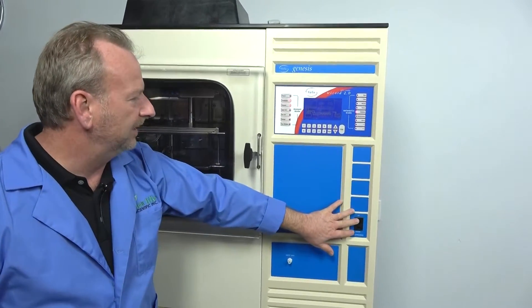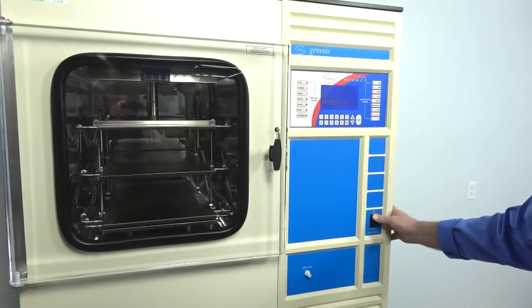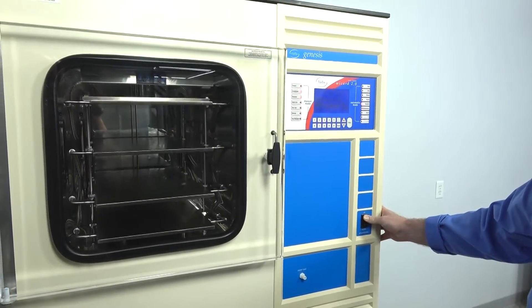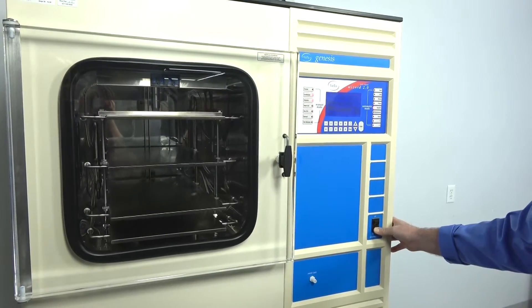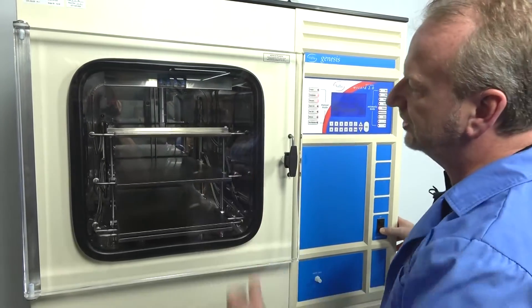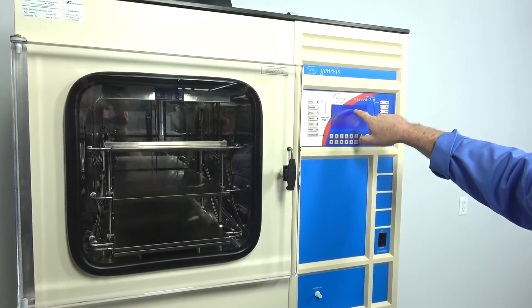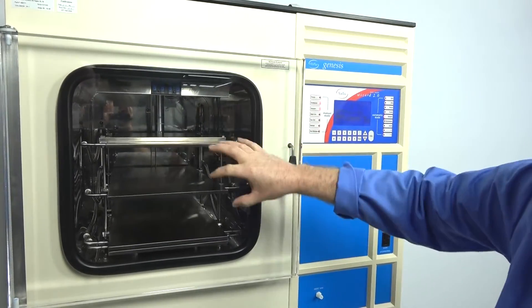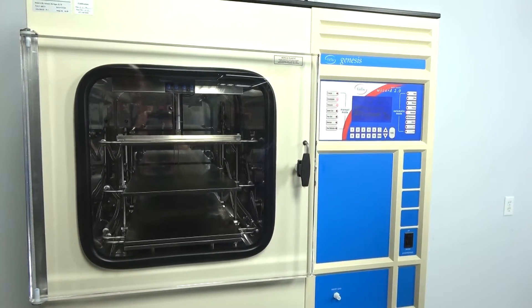Over here is the button that controls the shelving. I'm going to show you — it simply raises it up and lowers it down. We're pulling a really deep vacuum in this chamber right now. You can see over here it's down to 20 millitorr, or 19 millitorr. So there are no leaks in the system — just a well-kept machine that shows very little use.